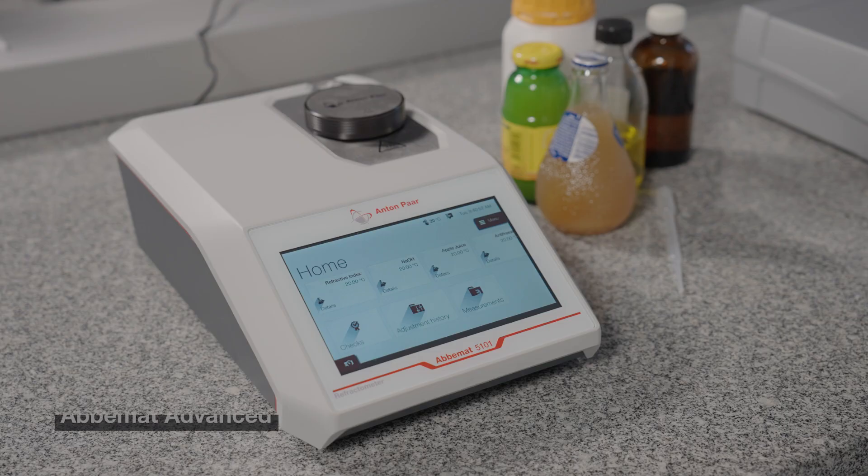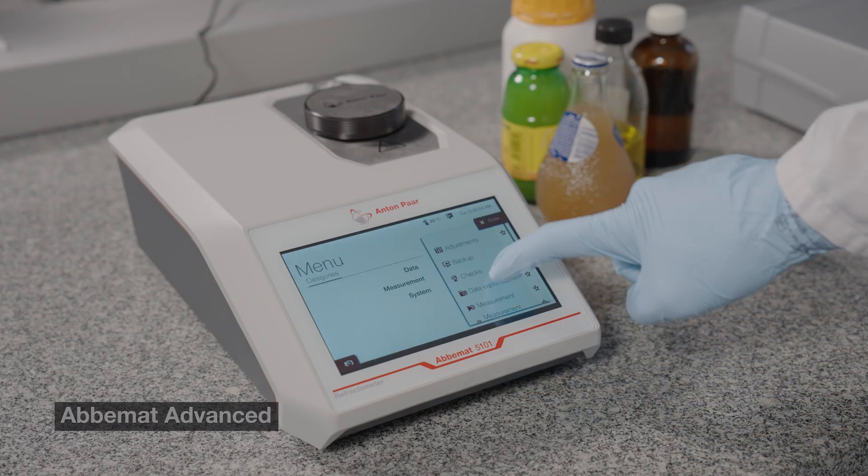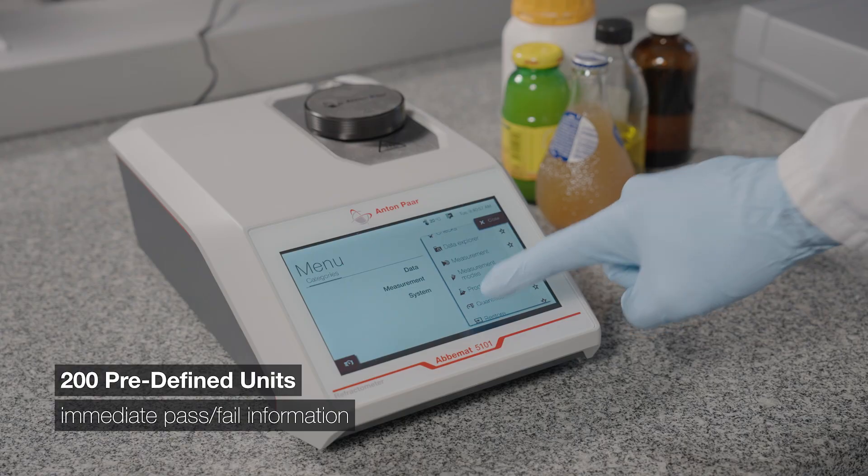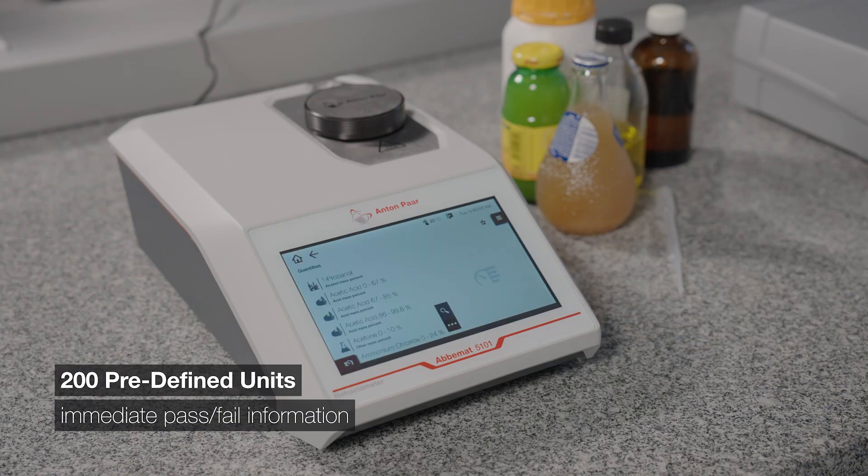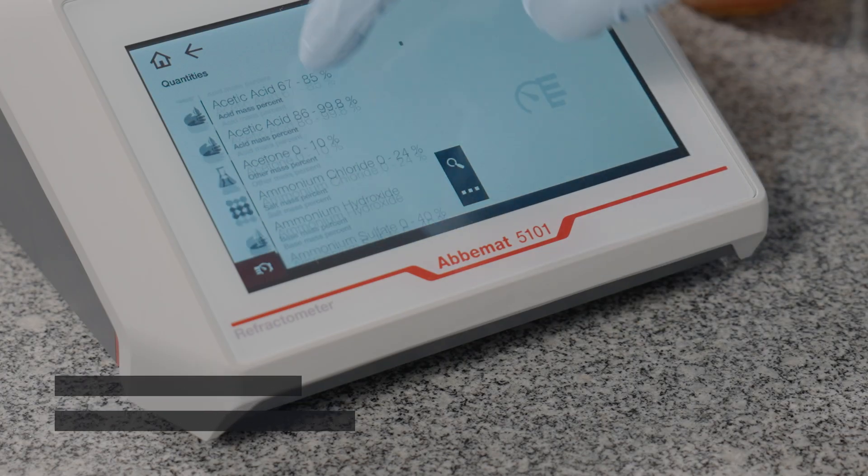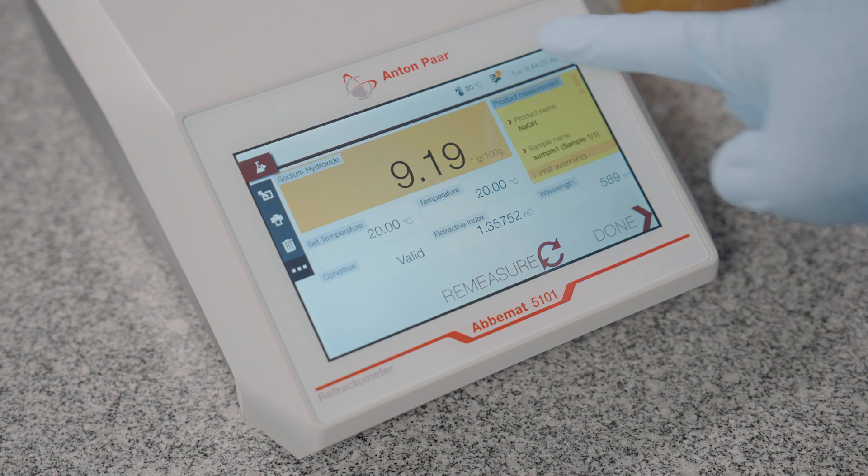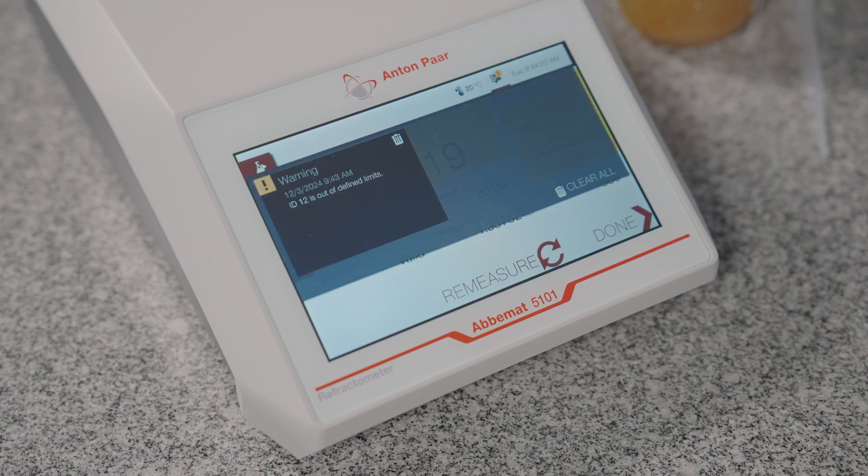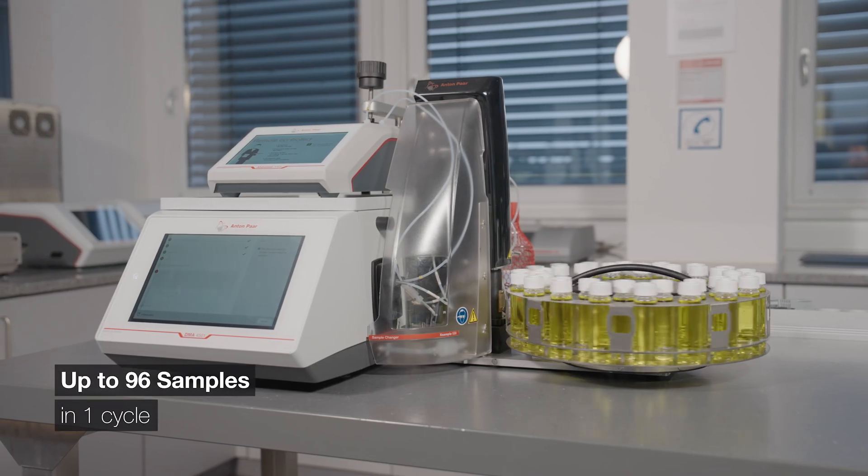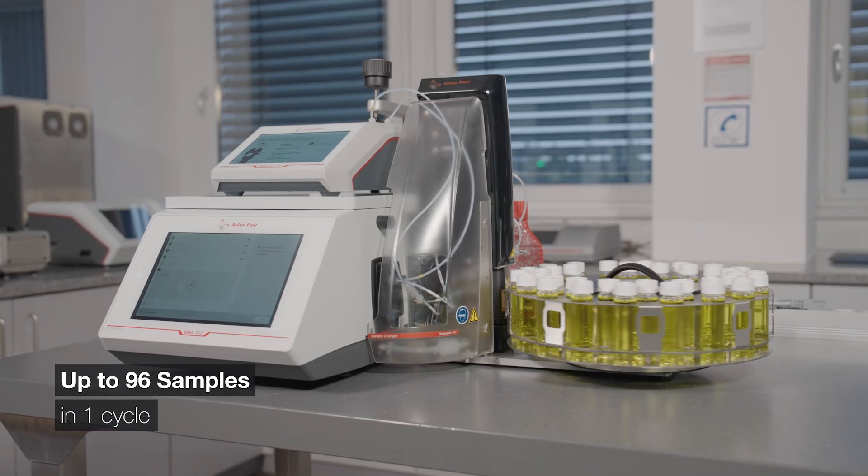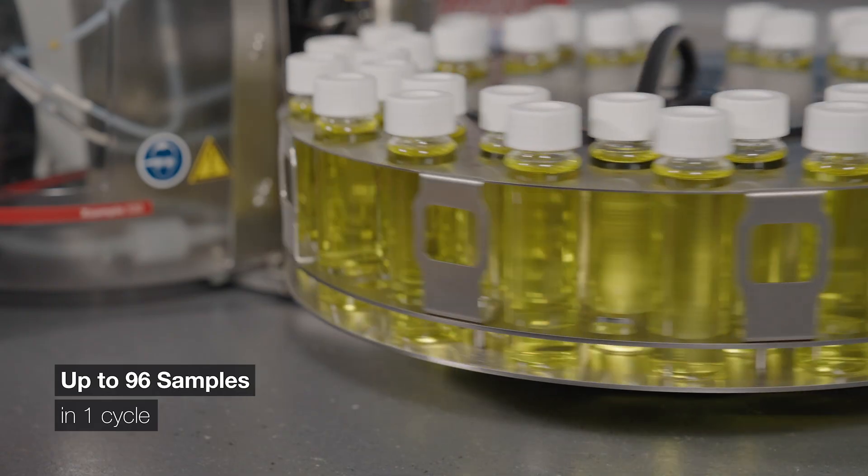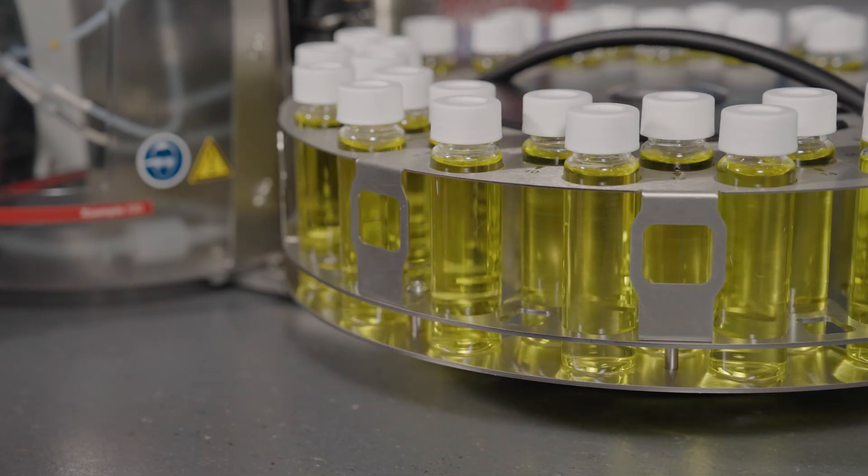Abiumat Advanced is your solution for fully networked analysis. It delivers results for more than 200 pre-defined units derived from the refractive index and shows immediate pass-fail information according to your acceptance criteria. You can combine it with other measurement parameters and automate it to run up to 96 samples in one cycle.